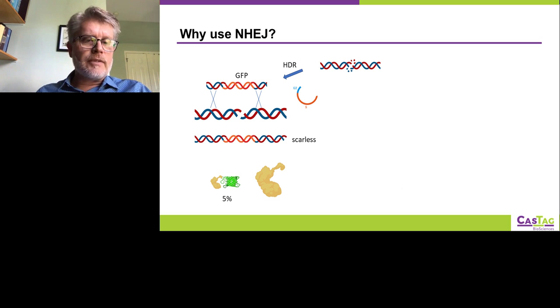And so down at the bottom, I've schematicized a protein of interest that's been fused to green fluorescent protein. However, this is typically somewhere in the range of 1% to 0.1%. In some cases, with very small inserts, this can be as high as 5%. But the majority of the cases are the protein alone, which is schematicized next to it without the GFP fusion.